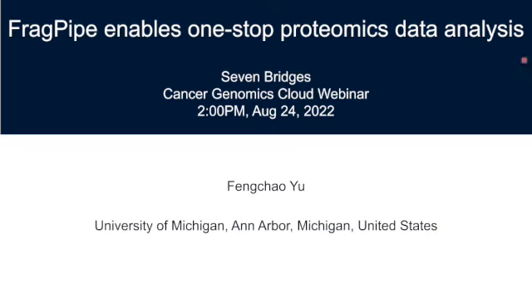Today's webinar series will focus on proteomics, and we will have Dr. Fengchao Yu, a researcher at the University of Michigan, introducing us to FragPipe as an application, as he's the leading developer and maintainer of FragPipe, MSFragger, and IonQuant. He's currently a research investigator at Alexey Nesvizhskii's lab at the University of Michigan. Rowan Beck, a community engagement manager at Seven Bridges, will show us how the FragPipe workflow works on the Cancer Genomics Cloud.